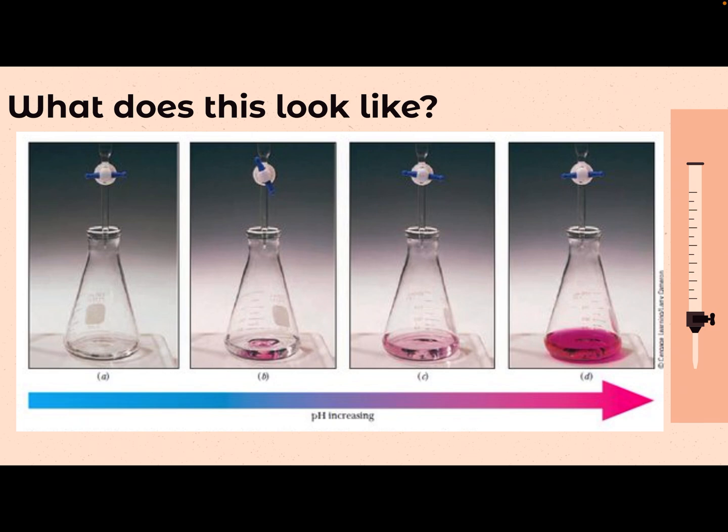So you want to be really careful when you're titrating not to add too much. One drop is quite a lot. You can even try adding half drops, and we'll talk more about those pro tips I have for you in doing your titrations tomorrow. So this is what it looks like.